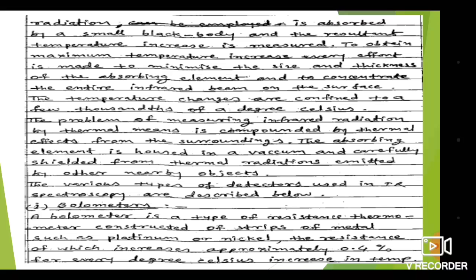Emission of thermal radiation is thus prevented by housing the element in a vacuum.